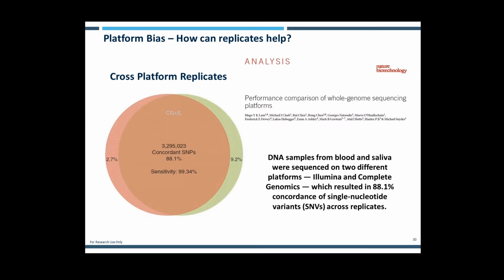And so while we see that the PacBio coverage levels are the least biased, and second to that would be Illumina, all technologies exhibit error rate biases in these high and low GC regions, and especially in long homopolymer runs. And so, as I mentioned earlier, by combining data from two technologies, you can reduce the coverage bias if the bias in the component technologies are complementary and of a similar magnitude.